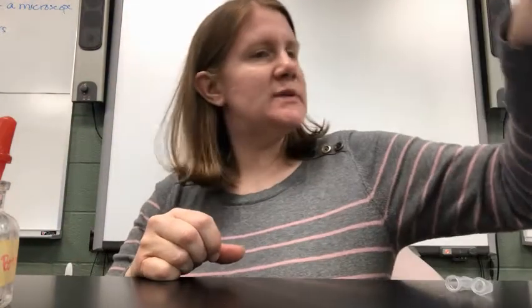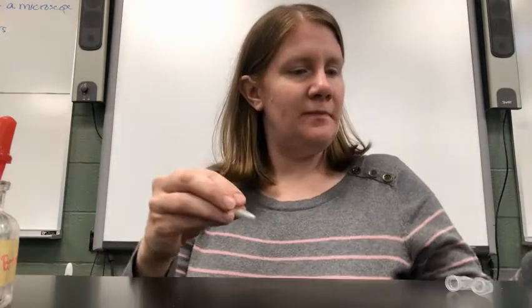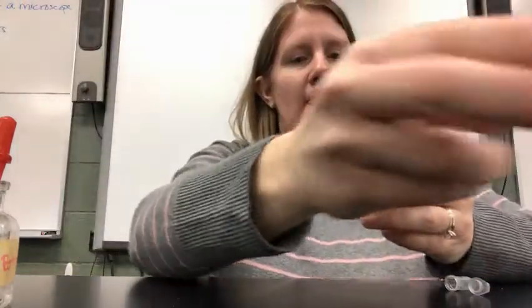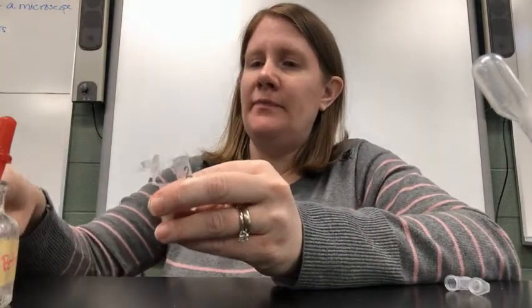Okay, now we'll go to suspect 2. So same procedure. Put my rubbing alcohol in there. Put a little bit of my sample.